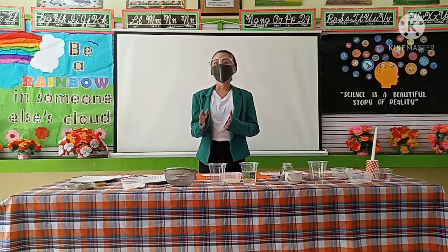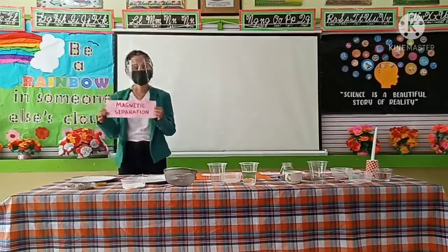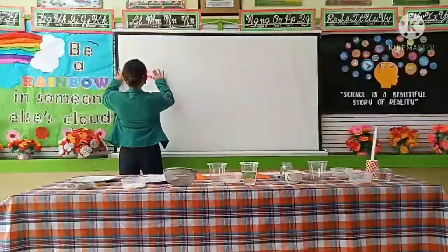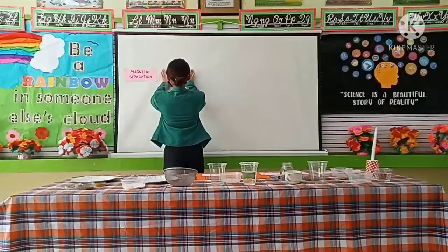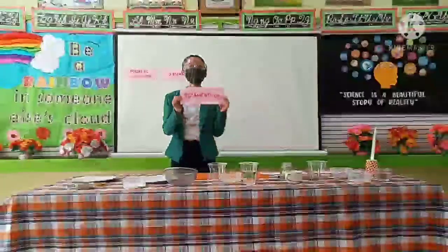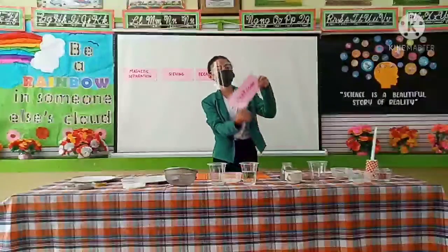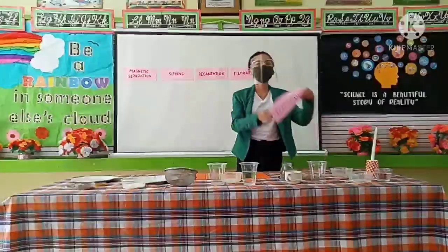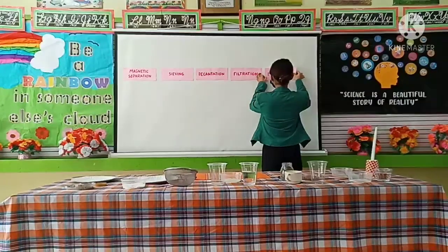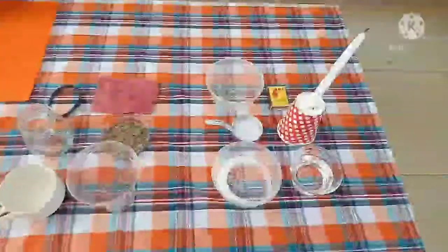So, before anything else, as I said yesterday, there are ways of separating mixtures, and that includes magnetic separation, the second one is sieving, we also have decantation, the fourth one is filtration, and lastly we have evaporation. So again, class, these are the materials needed for our experiment.